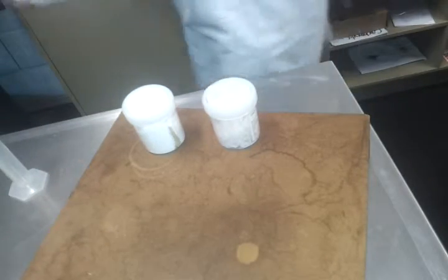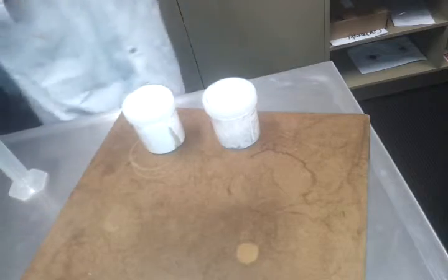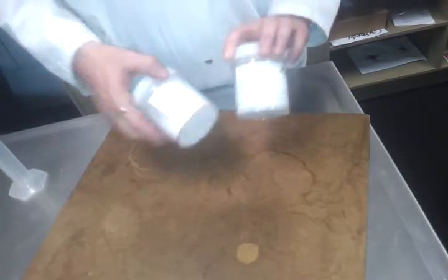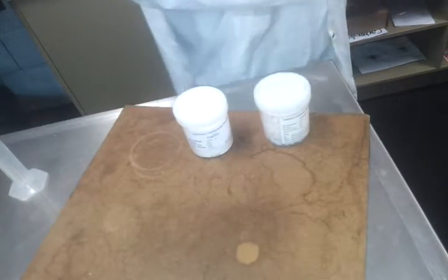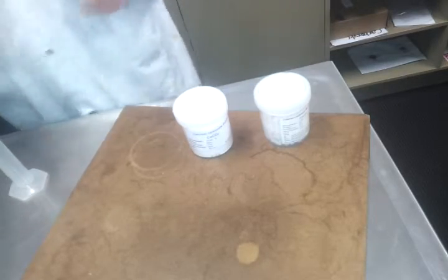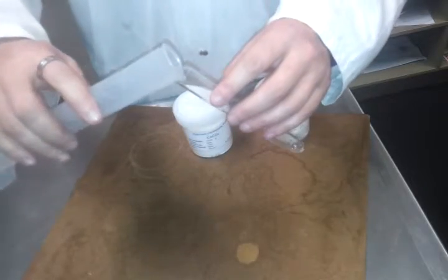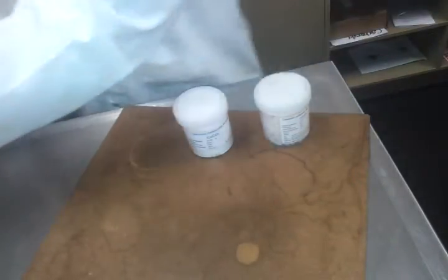Right, so what we're going to do here is go through a thing called the collision theory, which basically says why things react. What I've got here are two types of calcium carbonate. One's marble chips and one is a crushed powder. Chemically, they're the same thing, but we're going to observe their reactions with hydrochloric acid to see that there is actually a subtle difference.